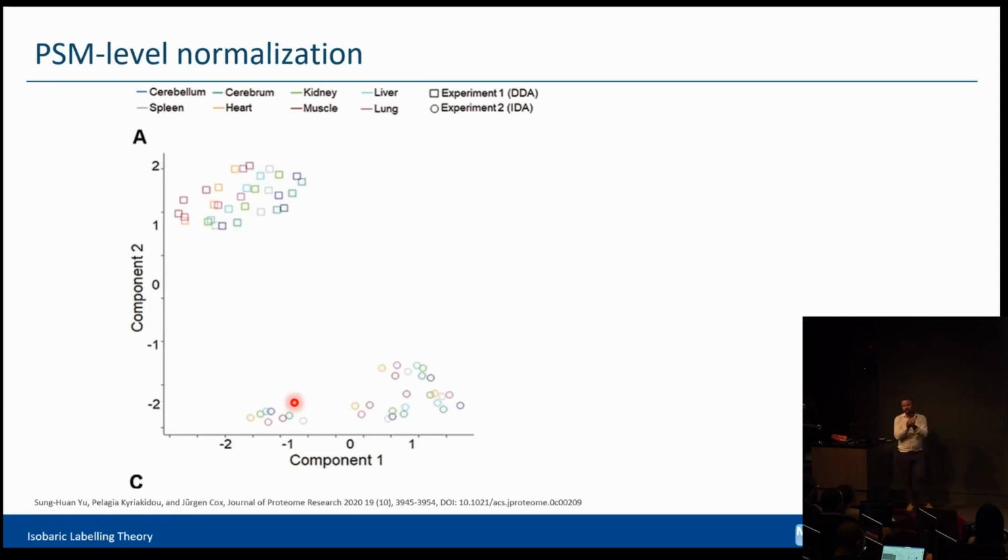This is a very good measure of how strong the signal was, and the stronger the signal was, the probably better the ratio is. Using this information for these channels, normalization factors are calculated by applying a weighted median.